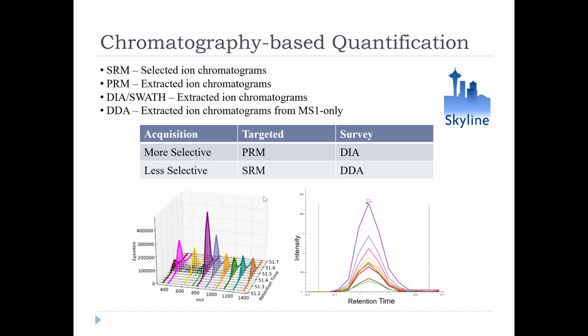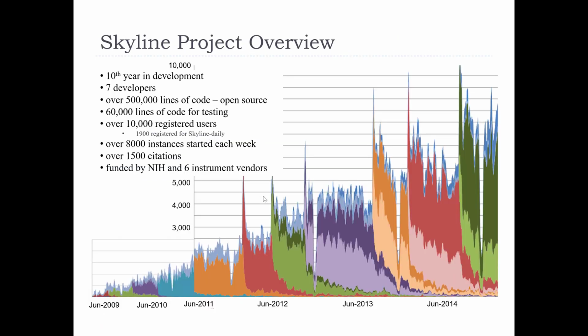Whereas with these two methods, DIA and DDA, in terms of acquisition you can just set the mass spectrometer up with some broad parameters, and then you can basically collect data about anything. And Brian gave you some clear reasons why you might want to go targeted. You're going to get higher precision data in a lot of cases. And if you can think ahead, and certainly there are a lot of clinical and pharma applications, people are now doing a lot more targeting.